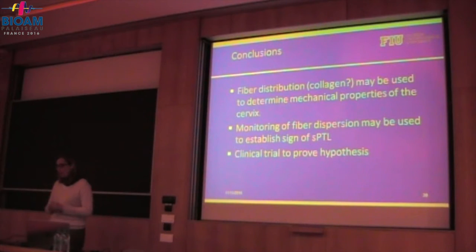But I think the cervix is pretty thick, so I think you can go much deeper. And we were kind of worried about crosstalk effects, or how much of the sampling we would do before we would lose that nice orientation. But we have not done that study, but I'd say it's a good one.